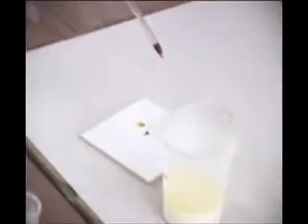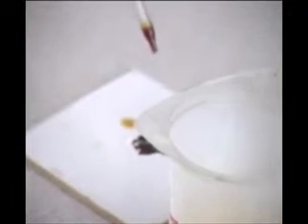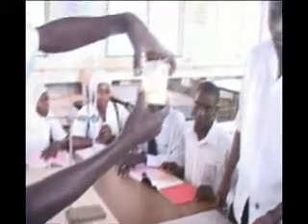This time he is taking from the iodine solution, and then he will drop a few drops of it. As the drops are going down, the food mixture will become blue-black in color. That blue-black color indicates that in that food mixture, carbohydrate, or starch, was present. So starch was among those food substances that were mixed in this food mixture.